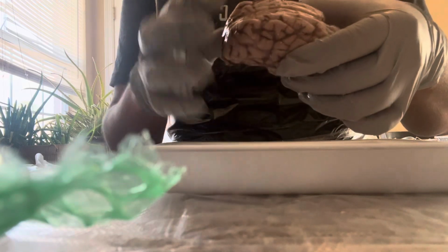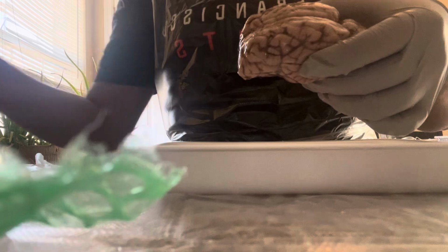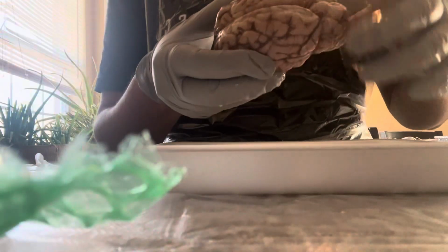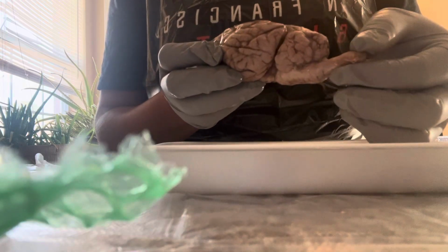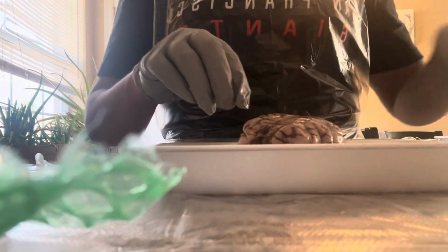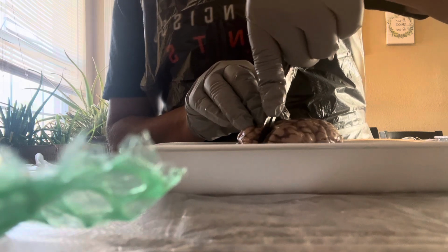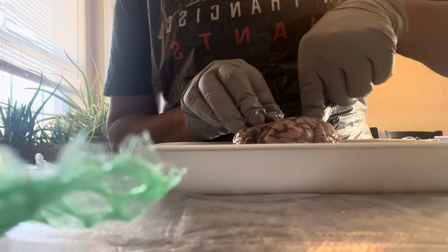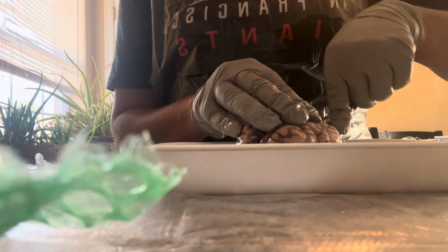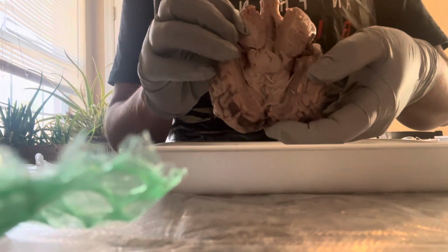And this is our cerebrum, which we have the ridges. And then we also have the cerebellum here in the back. That's the cerebellum. This is part of the spinal cord. Okay, I'm going to go ahead and get my scalpel and cut it in half. Here it is, cutting in half.